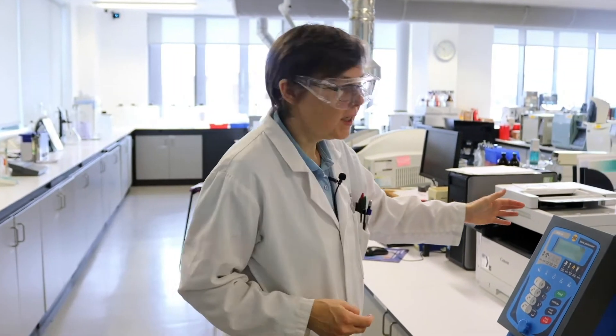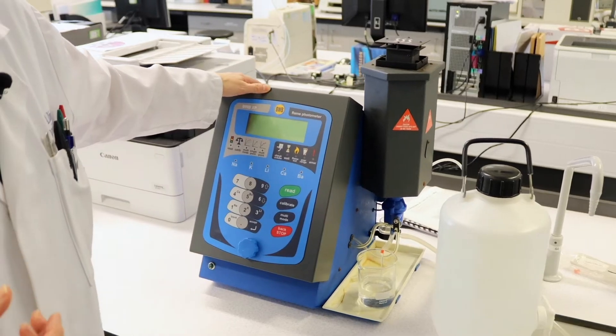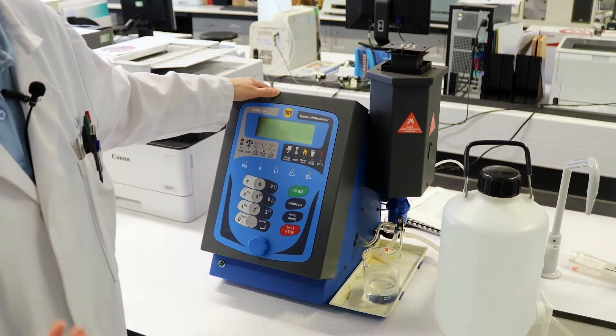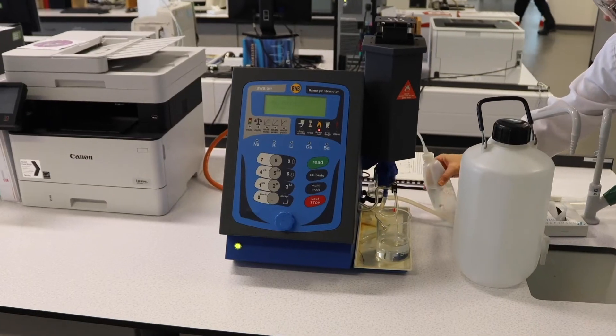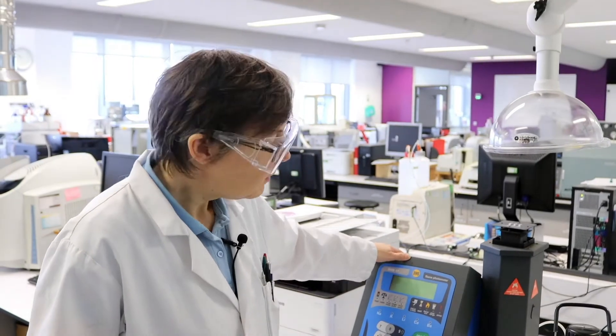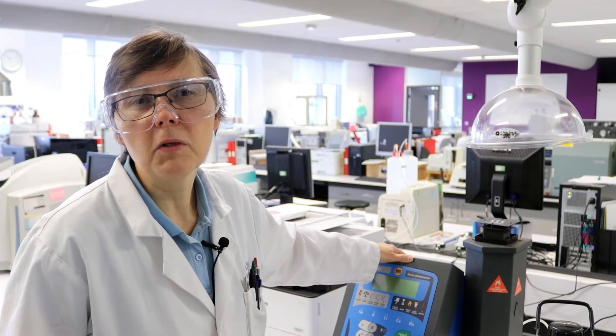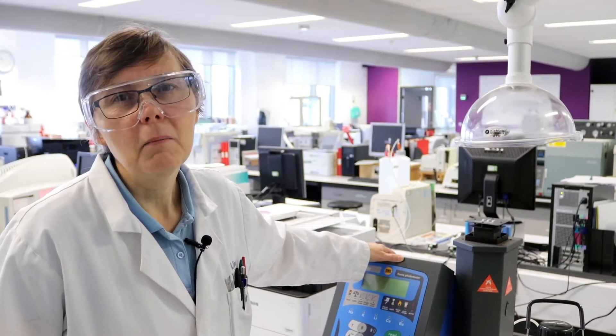On this bench we have a range of atomic absorption spectroscopy instruments, which are really good for metal analysis, and I wanted to show you this one in particular. This is a flame photometer — this is actually a flame emission technique, and this technique is an analytical version of what you might have done in your schools and colleges with your flame tests. So where you've perhaps looked at how sodium salts provide a bright yellowy-orange flame, this instrument will give you a reading for it, and one of the first practicals that you'll do with us is use this instrument to determine the levels of sodium and potassium in possibly contaminated baby milk.